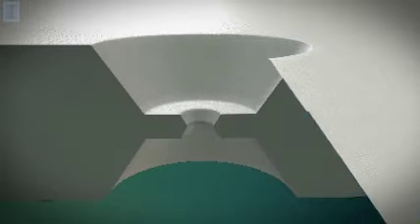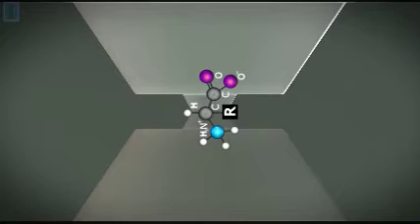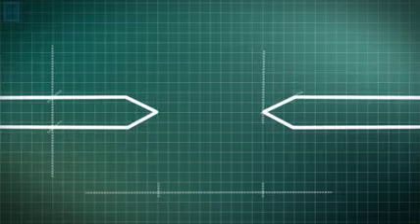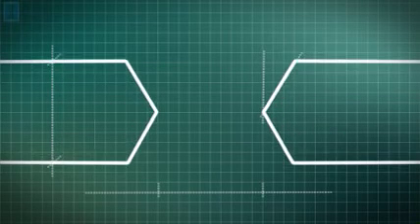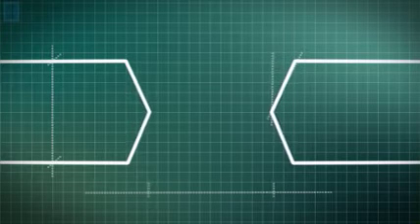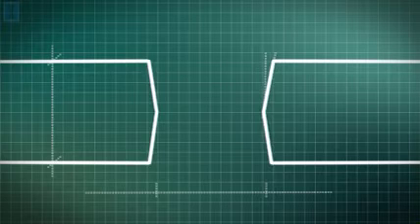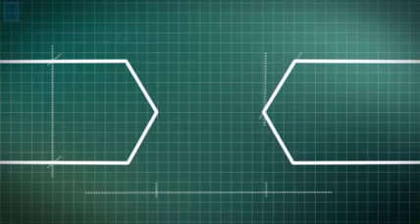This technology can be applied to filter body fluids, to selectively filter urea or creatinine, or to read strands of DNA. The nanopore can also trap more complex entities such as an amino acid. The geometric elements of the nanopore, such as the membrane thickness, approach angle, and diameter, as well as the semiconductor material and doping, can be adjusted to fit the user's specific need. The flexibility of the technology allows for a higher functionality.